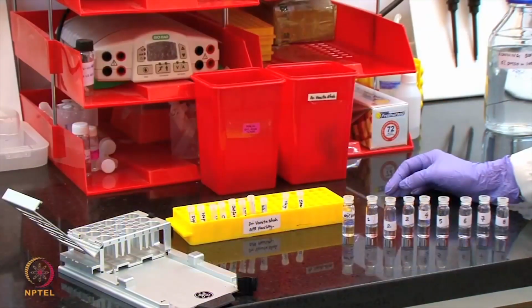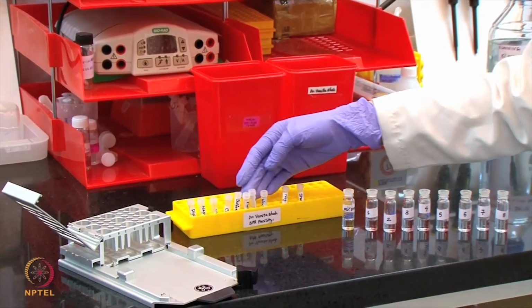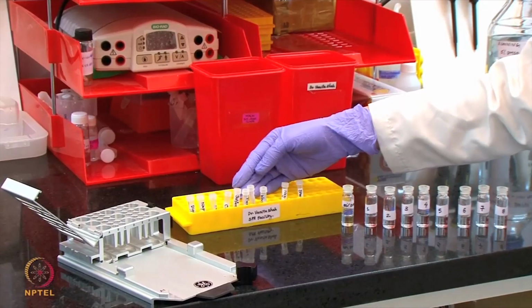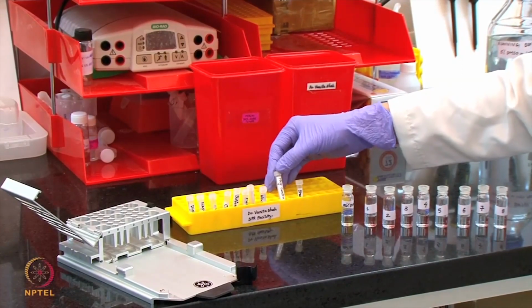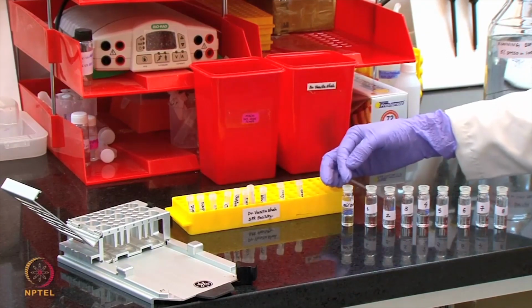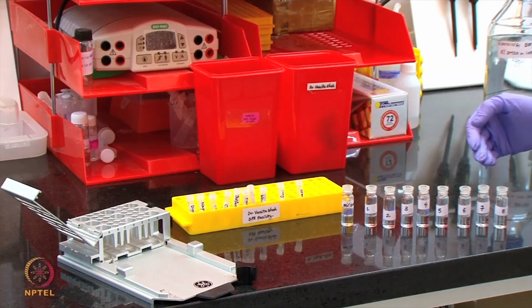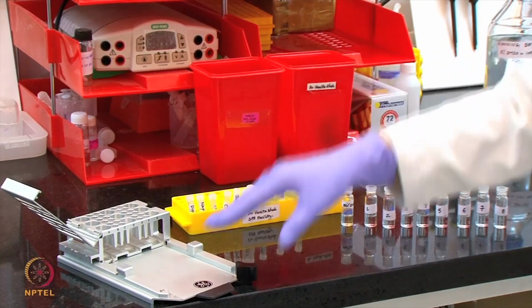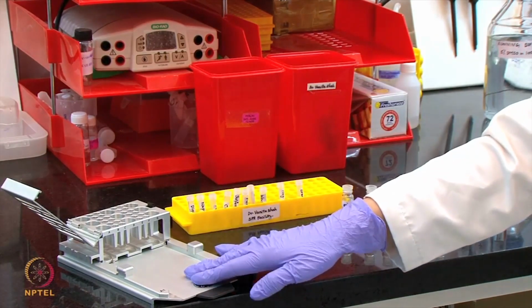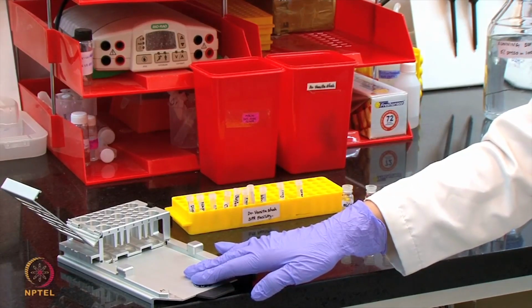We will now proceed to insert these tubes, including the samples at 30 micromolar concentration, the negative control, the startup, 50% DMSO as wash solution, and the solvent correction solution into the appropriate rack and then into the system to perform the protein small molecule screening assay.